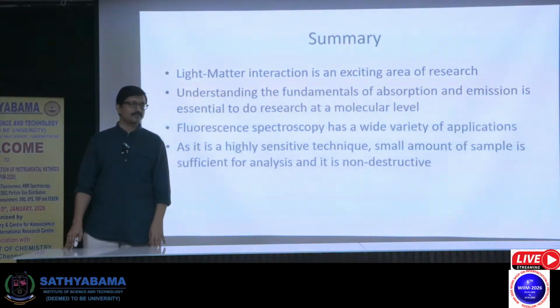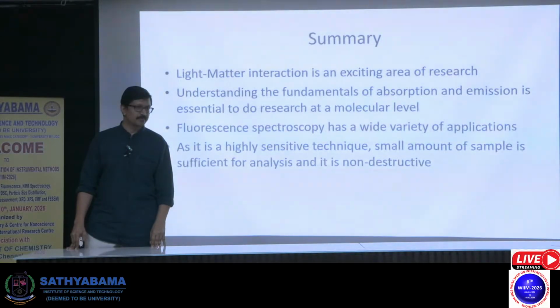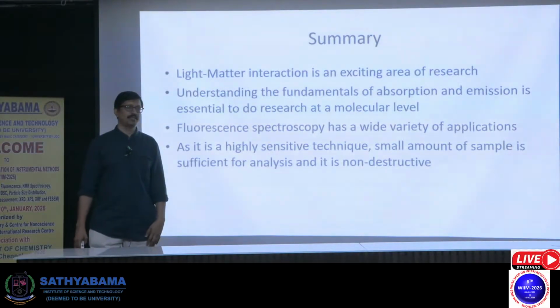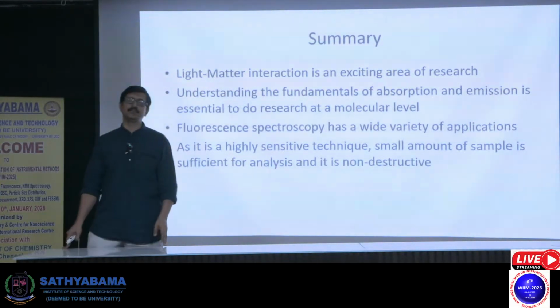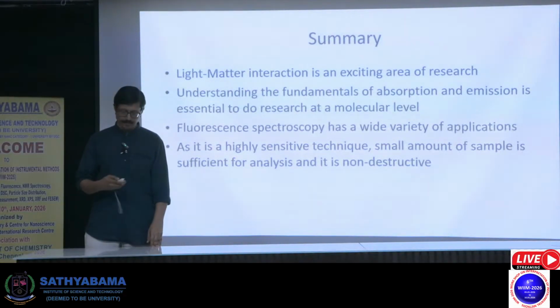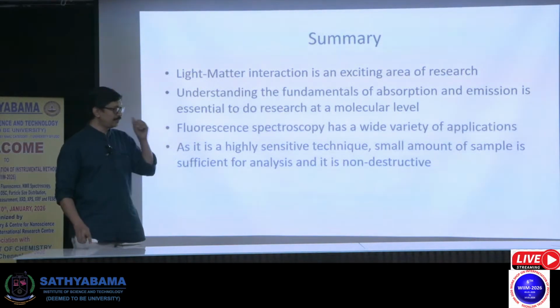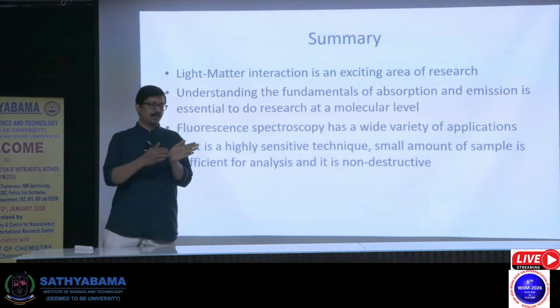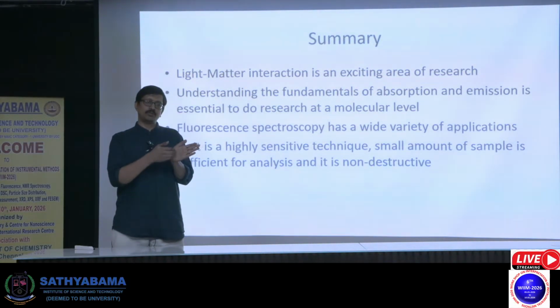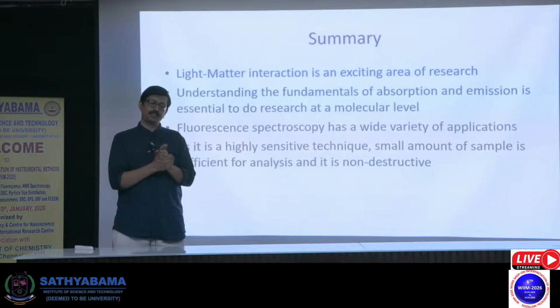What kind of sample nature? Yeah, so all possible. All 3 states are possible. Most of the things people do in solution state. That's easy to handle. Is there a solid version? Solid is also there, because if you look at that instrument layout which we did not discuss, we collect fluorescence from the 90-degree angle. So you can use solid state, solution state, gas state, thin films, gels.